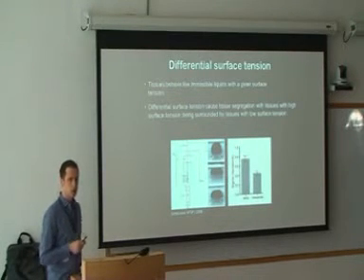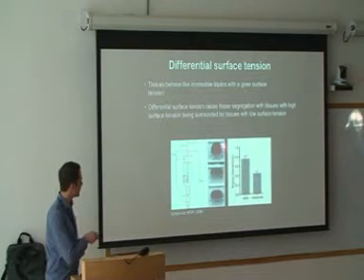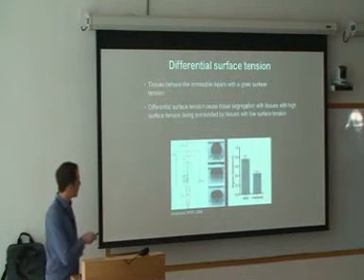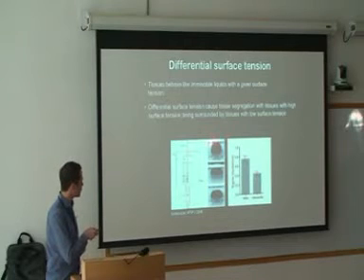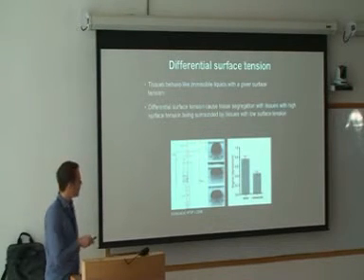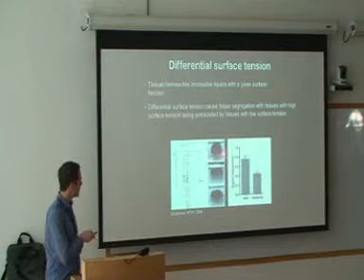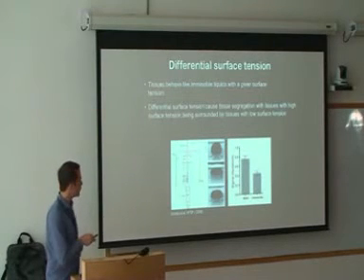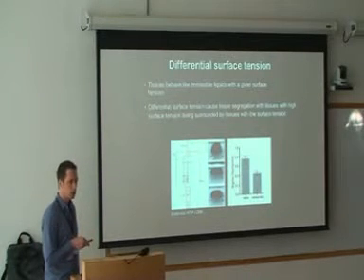You put it into a culture dish. You wait till it has really rounded up. It's completely spherical. Then you put it between the two metal plates. And then you move the upper plate down and record the force by which this movement down is resisted. And you're looking at the deformation of this spherical aggregate. And from the deformation and the force, you calculate then the surface tension. And you can do that for ectoderm tissues, but you can also do it for mesendoderm tissues.